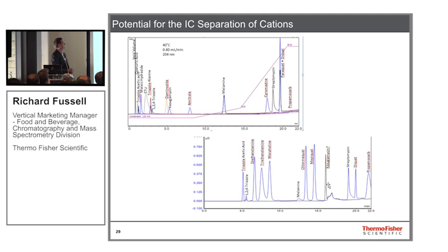And these are the very first chromatograms which have been generated. These are at relatively high concentrations, because this is not mass spec detection. This is detection with conductivity or UV. So we have to bear that in mind. And it might be, when we translate this to mass spectrometry, there may be some problems with the lower concentrations if the compounds bind to the system or the matrix or whatever. So we're aware of that. But you can see here that we've got the triazole metabolites, there's maleic hydrazide. ETU is a very broad peak.